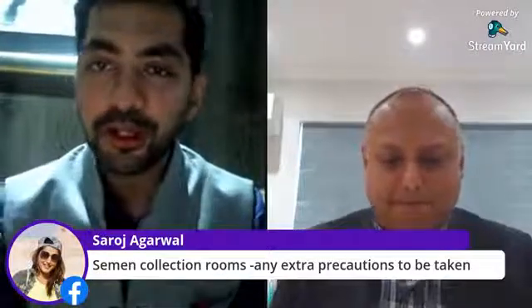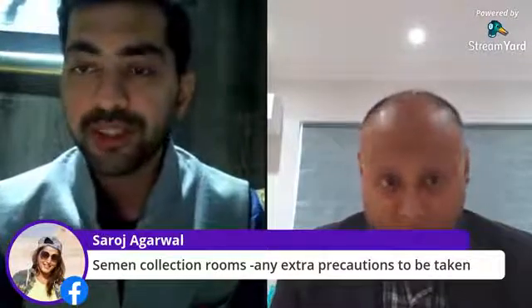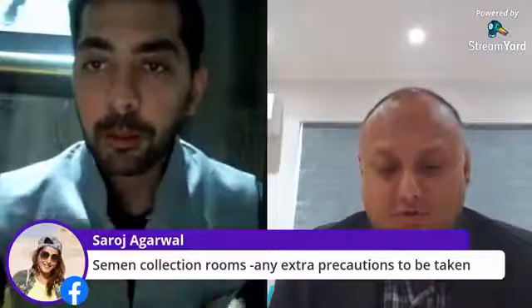Precautions in the laboratory, with the equipment first, and then with the staff. Okay, so let's take it in reverse. First, let's talk about staff. Staff will definitely need to have the right PPE.